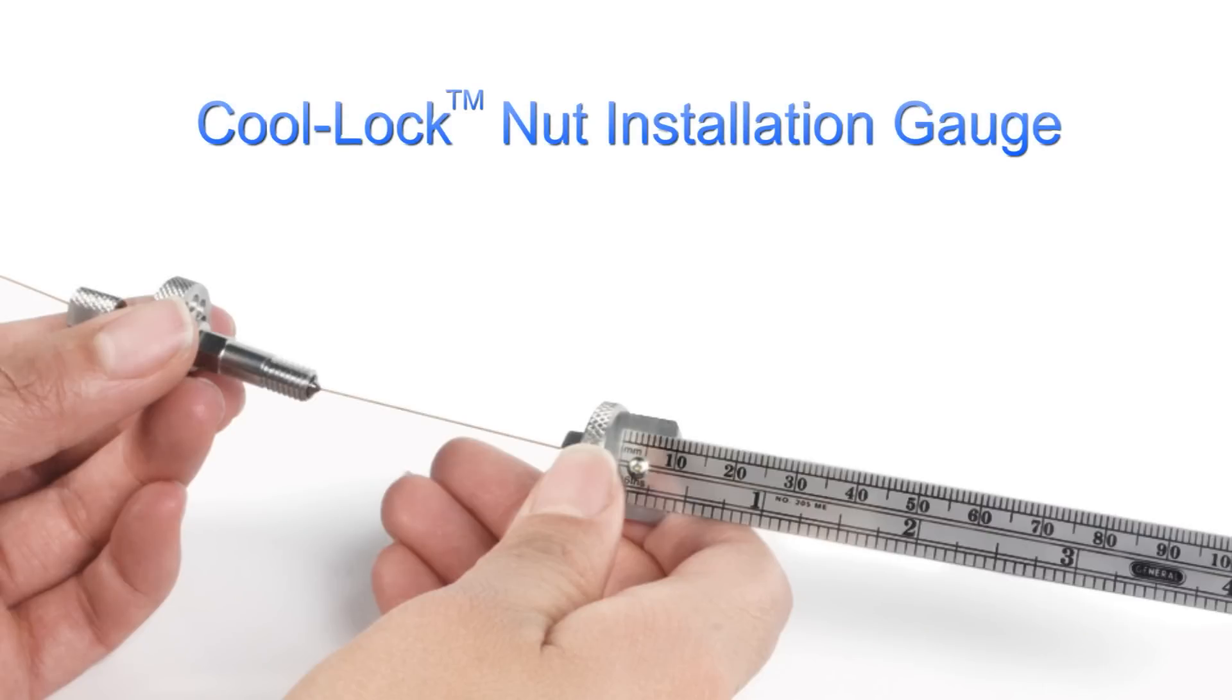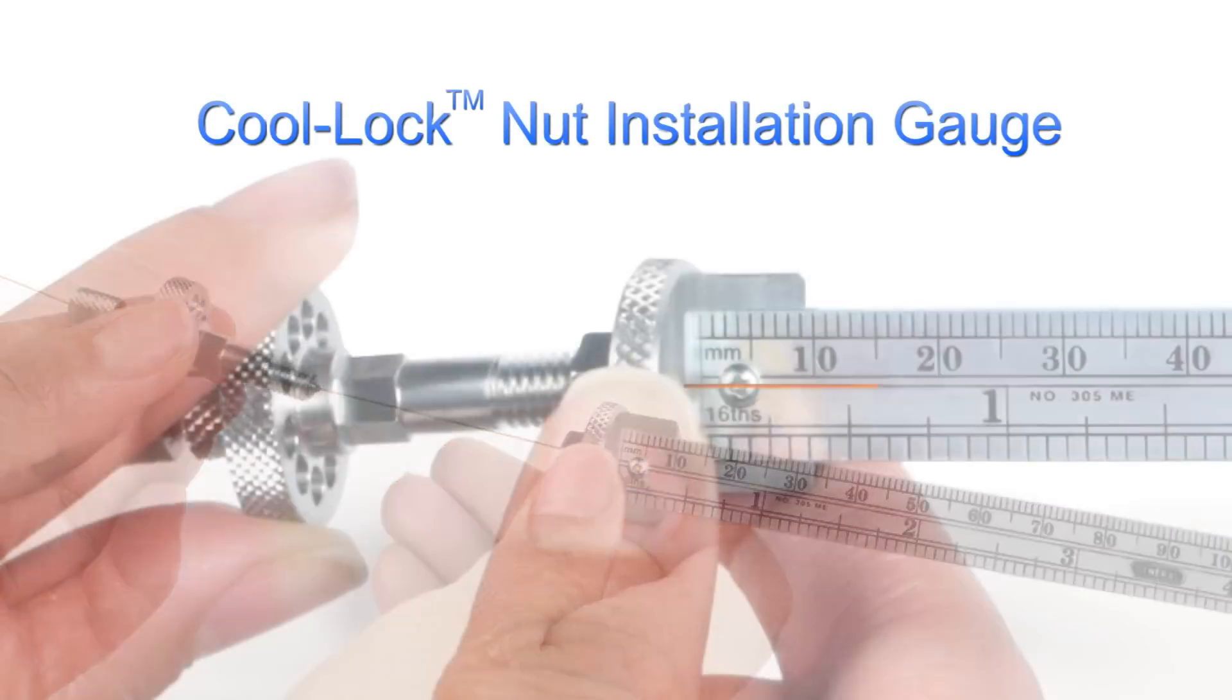For this installation, we will also use the cool lock installation gauge to increase our accuracy and help properly install the GC column at the right depth. Now that we're familiar with the parts of the cool lock nut, let's get started.